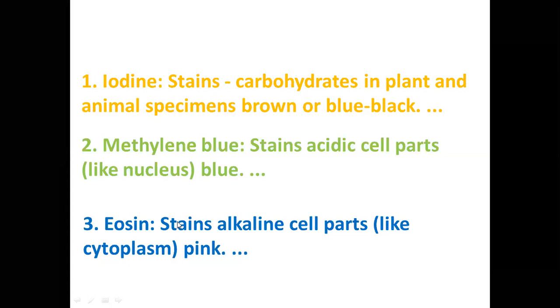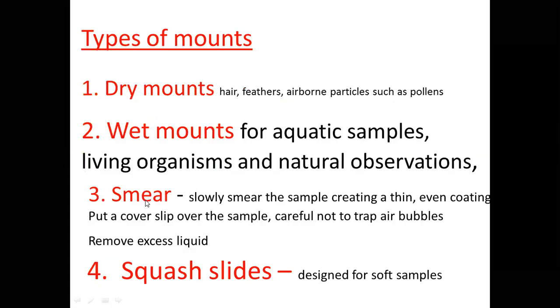Now, having said that, the language of staining, now we have 4 types of mounts. When I talk of mounts, I'm talking of types of slides that you can be asked to make. Like now, the 2014 was a very interesting one. It was a very interesting one because it was actually my first experience with a wet mount. Anyway, the first type of slide is a dry mount.